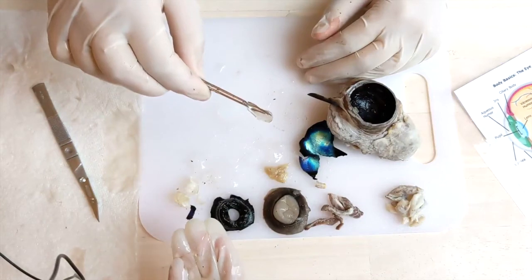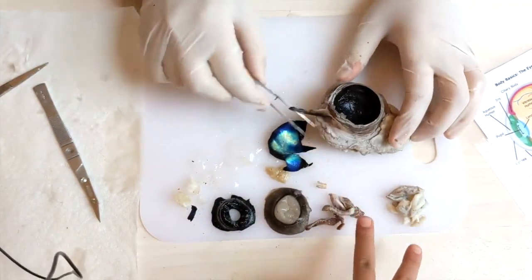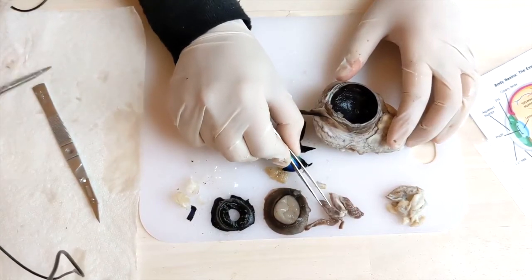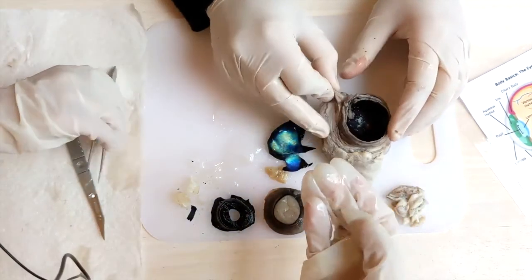Ha, ha. I have a question though. Okay. Why do you ask us all this stuff? Oh, what is this? Hold on. Let me see. Muscles? So these are muscles and this is fat. Okay.